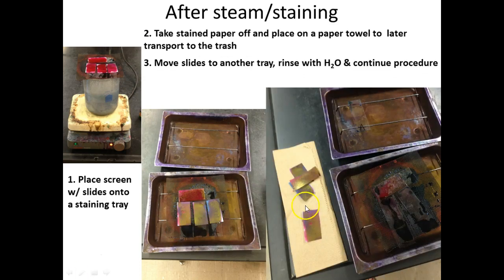You take your filter paper off, put it on a paper towel, so you can transport it to the trash without dripping dye all over our floors. As you can see, they're already pretty well dyed. Each person gets a slide. The slides that are pre-made have an A on it, so that's how you know the top of the slide. You want to keep track of the top of the slide, because that's where the bacteria are.